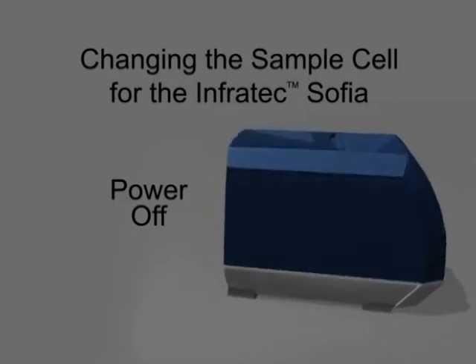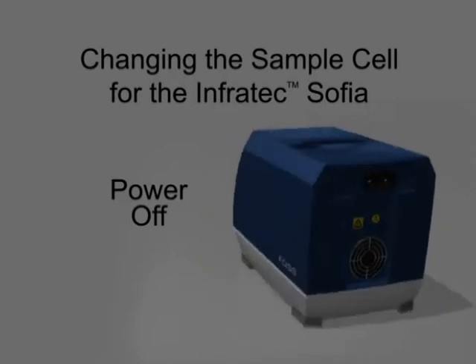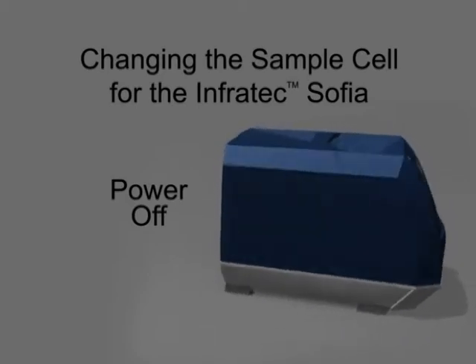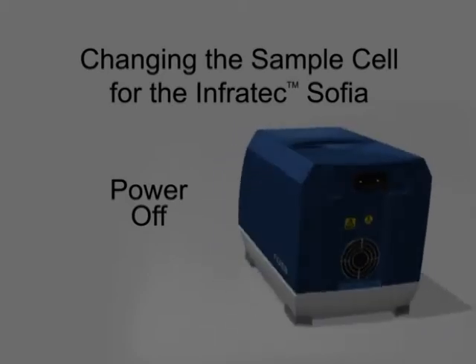Infratec Sophia uses different sample cells depending on the size of the particular grain being analyzed. The sample cells can be changed while the instrument is powered on or powered off.